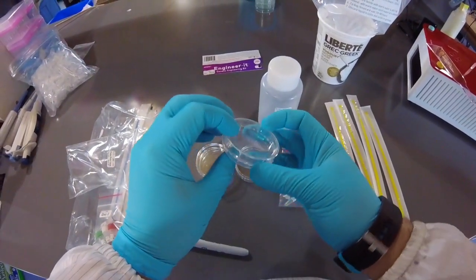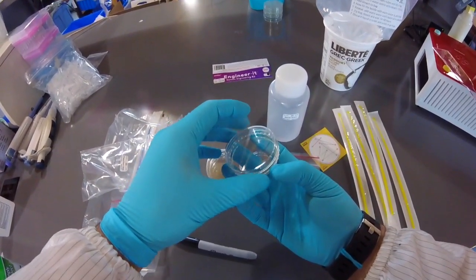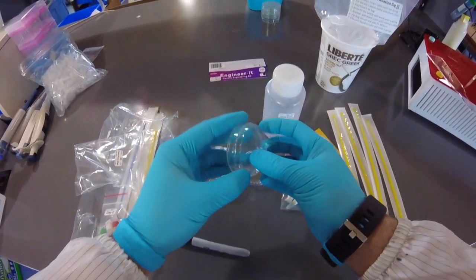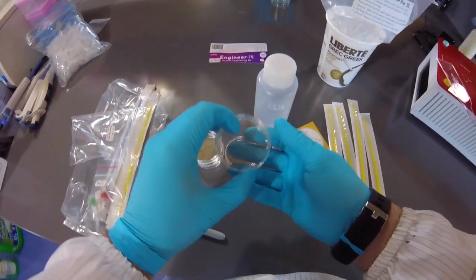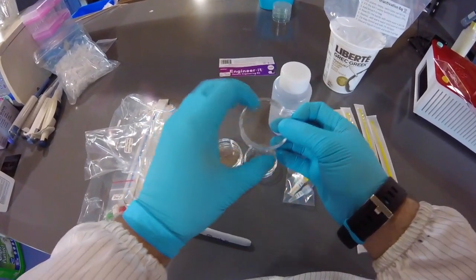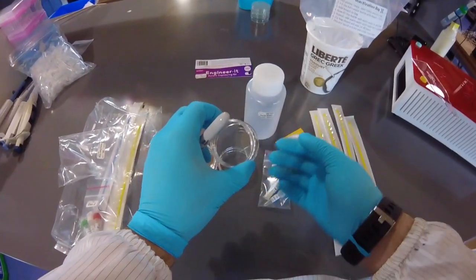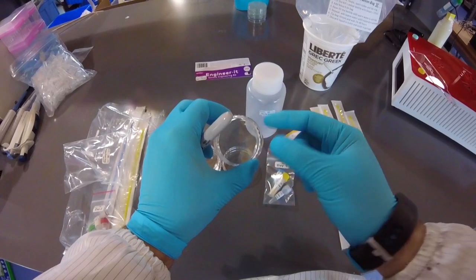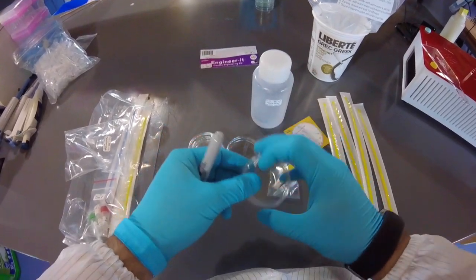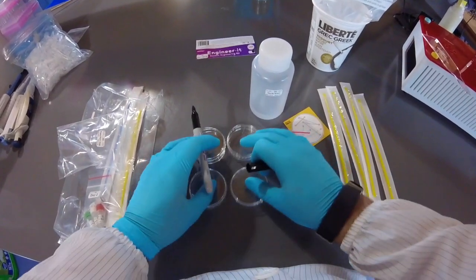So it's important to know that with the Petri dishes, the bigger part, which is going to be this here, is the lid, and then the part that has the star on it, so you can see there's a bit of a star there, that is the bottom, okay? And so ultimately we're going to be pouring into the bottom, okay? And we always label the bottom of the plates because the lids can fall off, and if they fall off, they might get swapped around. And so if you label the bottom, which is where we're going to pour the agar, your label will always stay with the agar, okay? So that's important.